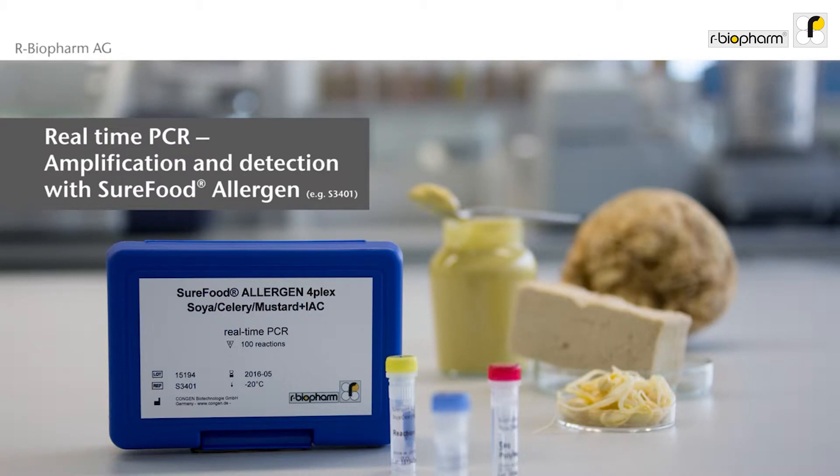Real-time PCR: amplification and detection with SureFood Allergin, for example S3401. The video shows you how to use the test kit SureFood Allergin S3401, which combines detection of soy, celery, and mustard as well as an internal amplification control in one reaction tube.